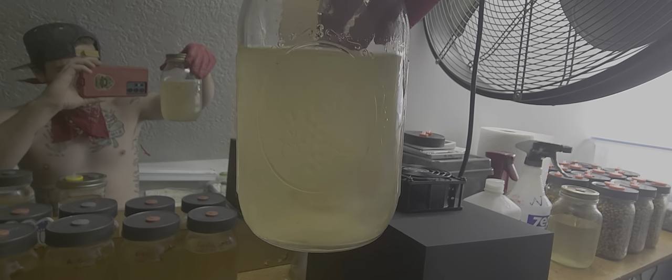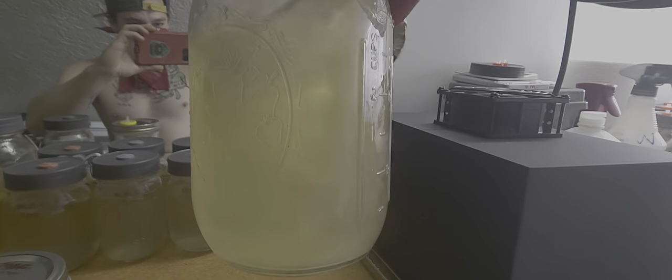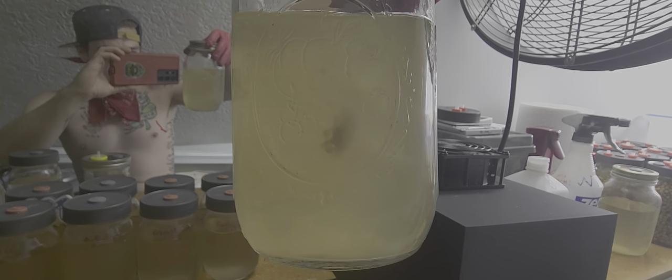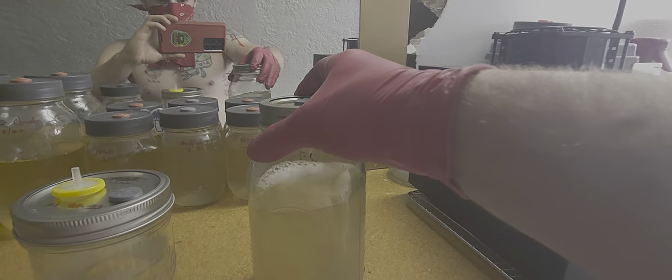Yeah, see that — it doesn't look very good at all. The water is not clear. It just looks like — I said it was clear and had the culture at the bottom before I stirred it, but as soon as I stirred it up it looks like dirty pond water now.